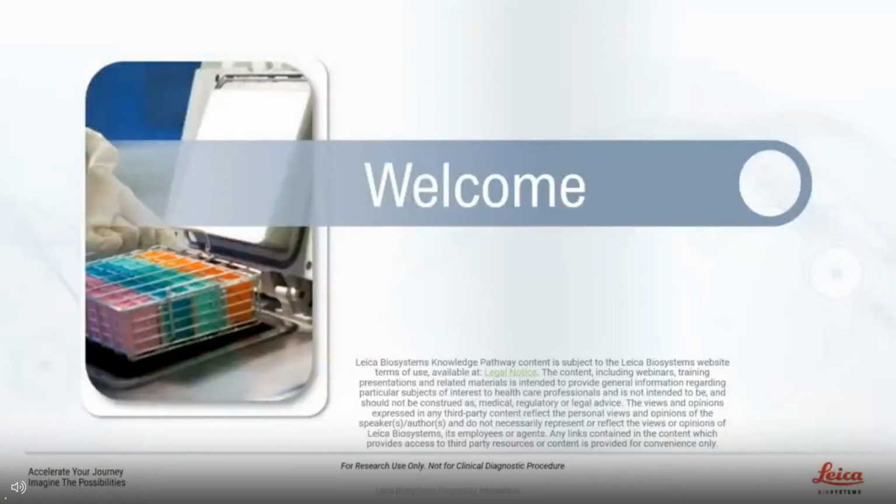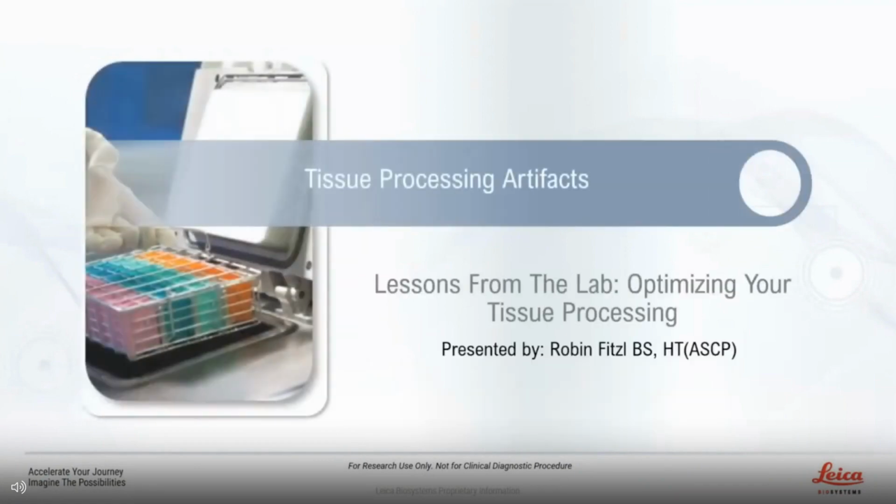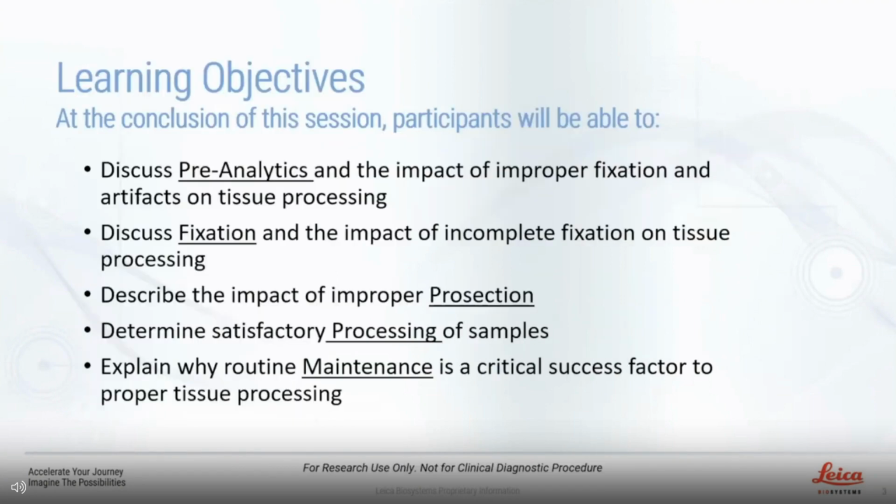And thank you for that introduction. This webinar, entitled Tissue Processing Artifacts, will discuss how to optimize your tissue processing and recognize the cause of common artifacts. The learning objectives for this webinar are as follows.